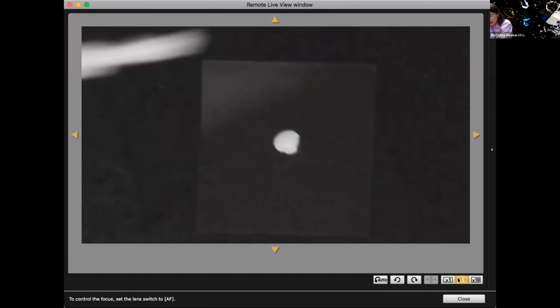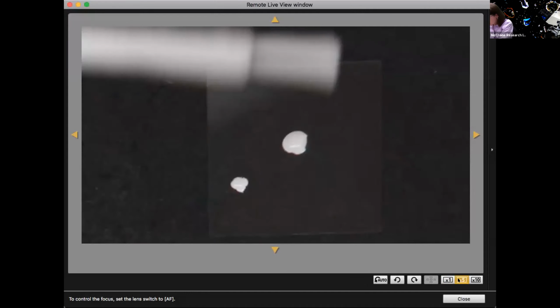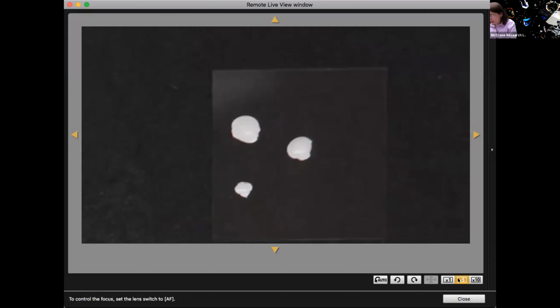So with these correction fluid stops, again, of course, give your liquid a good shake, and then I would recommend trying a couple of them to make sure that you're able to get a good round spot. I say that because sometimes round cover slips might be in short supply, but these square ones, you have plenty of them. So make sure you can get a good, decent stop. And then once you're sure you can do that, certainly start on your round ones.